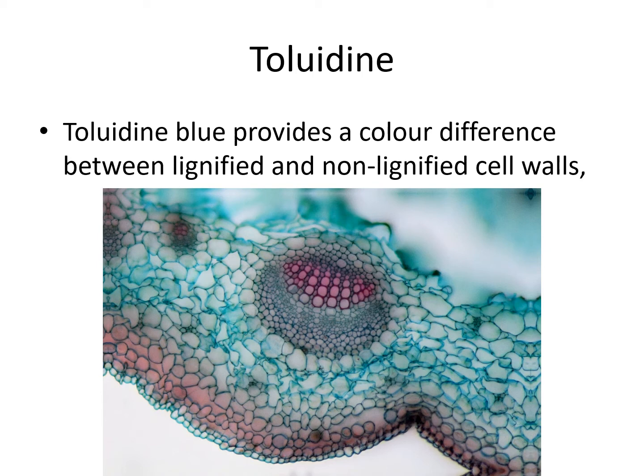Now I'm going to try and highlight things. So that would be the xylem, all of this stuff here. The phloem is that layer there, so that bit there, and then the sclerenchyma is that bit there, so kind of that band. Okay, so let's just get rid of that. So yes, that is a very, very nice diagram, and so all of this stuff here would just be parenchyma, it's just packing tissue.